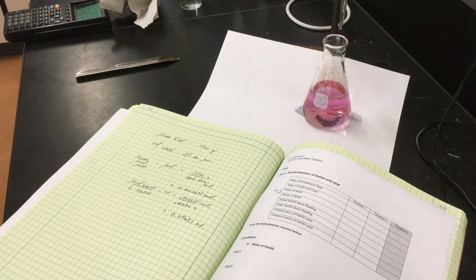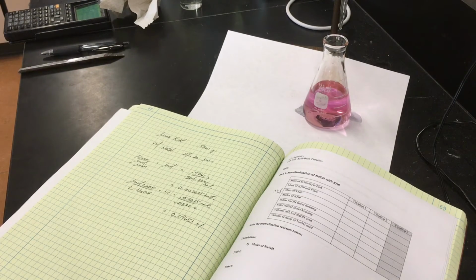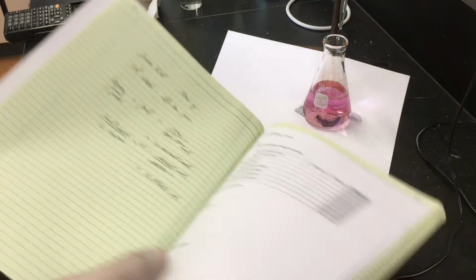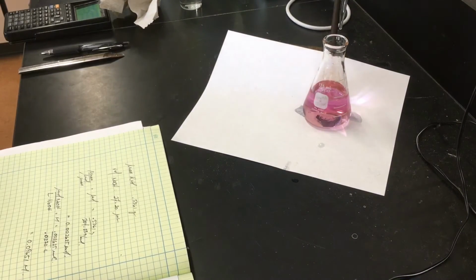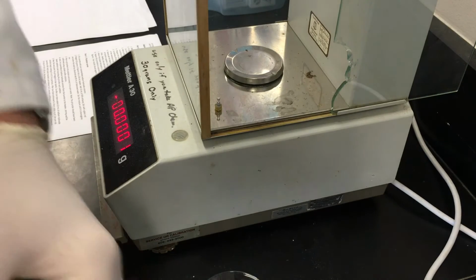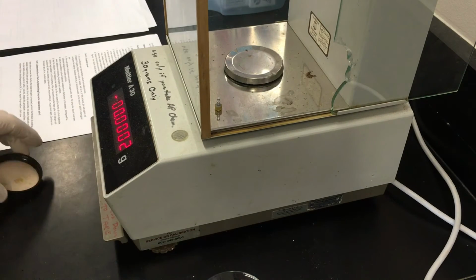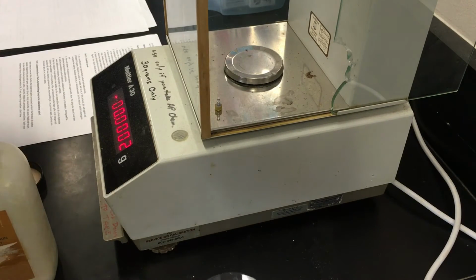Now that we have the concentration of NaOH, we can find the Ka of aspirin. So we're going to reload the burette and measure a little bit of aspirin and make a solution. So now that we have a standardized NaOH solution, we're going to go ahead and make the titration curve. And to do that, we need to measure 0.36 grams of aspirin. And then we're going to dissolve that in 95% ethanol.